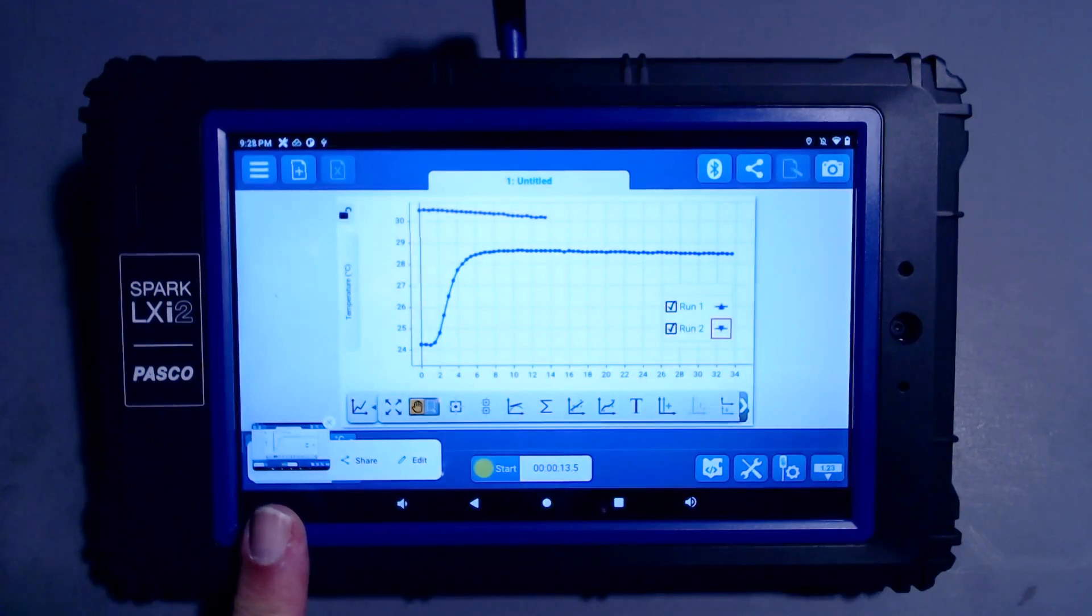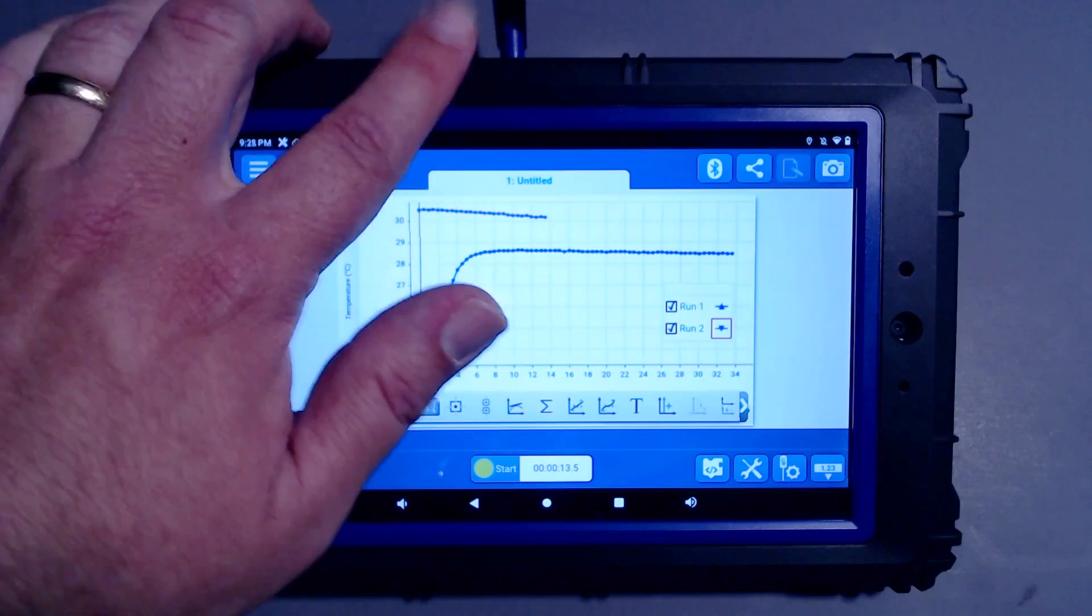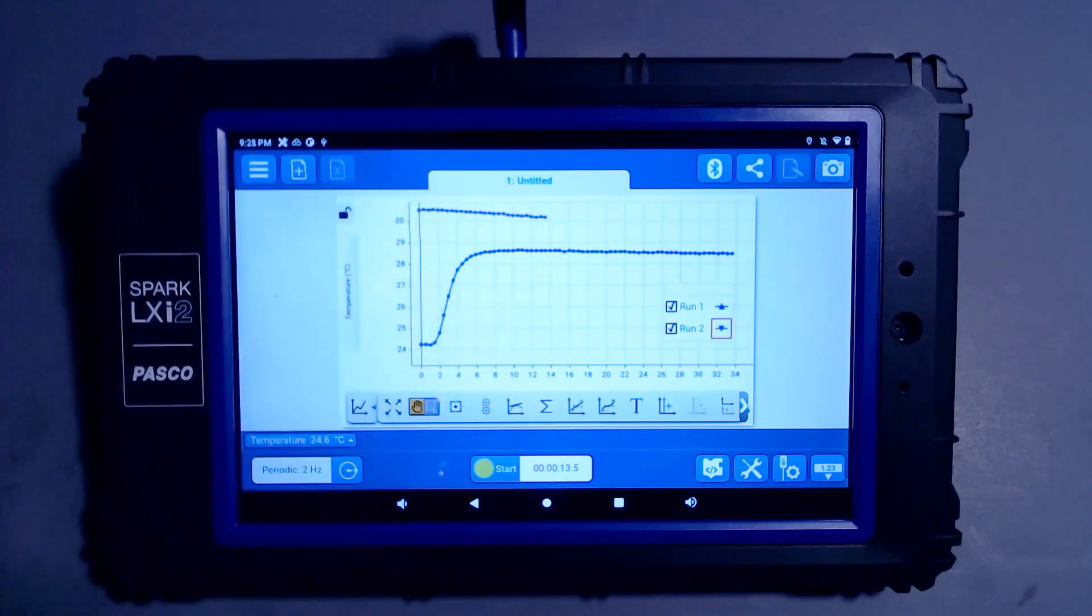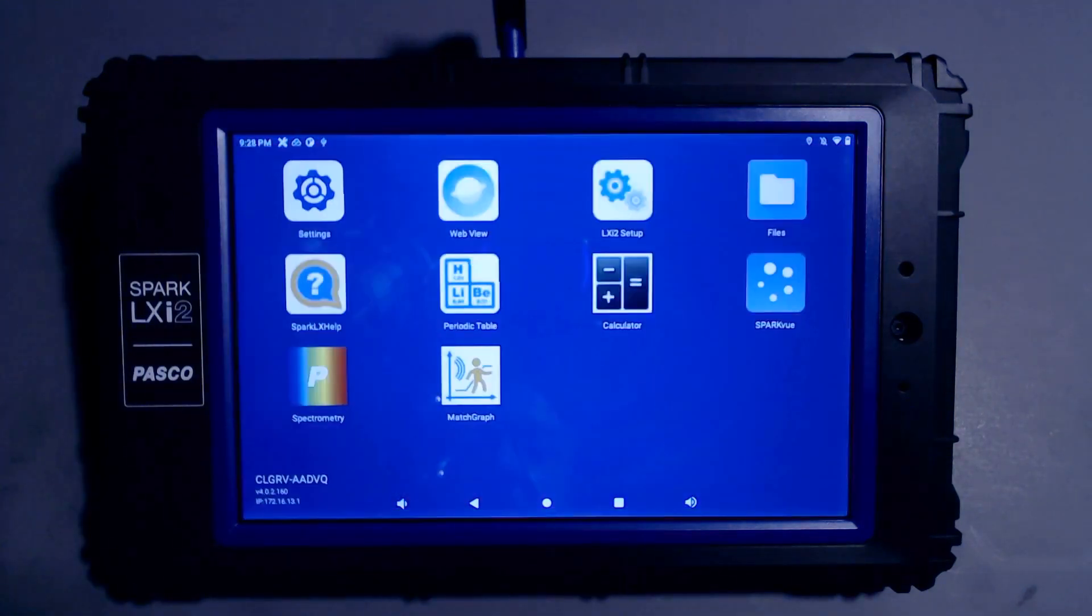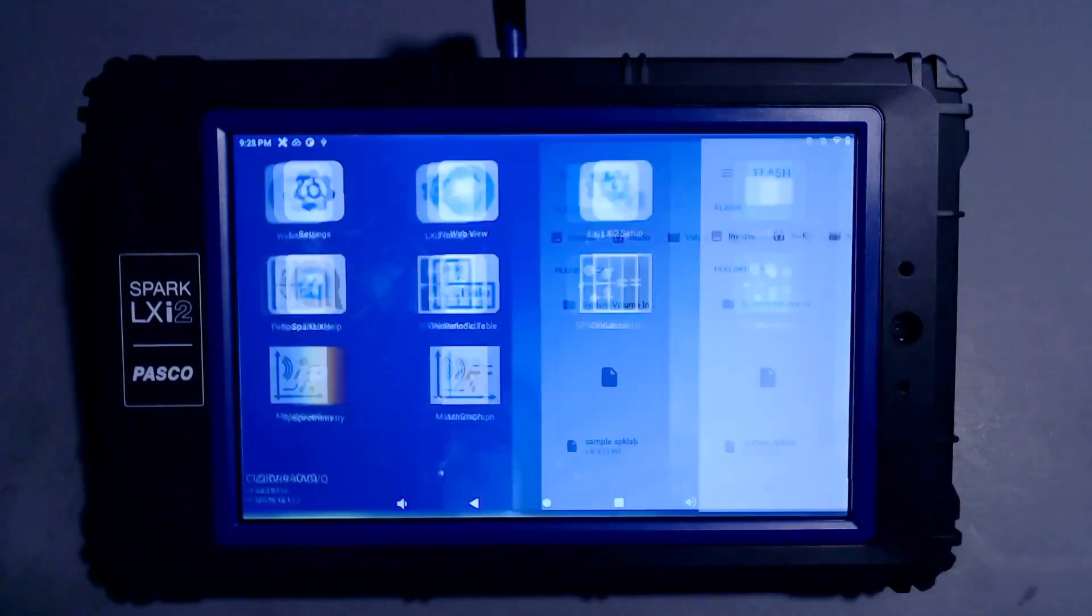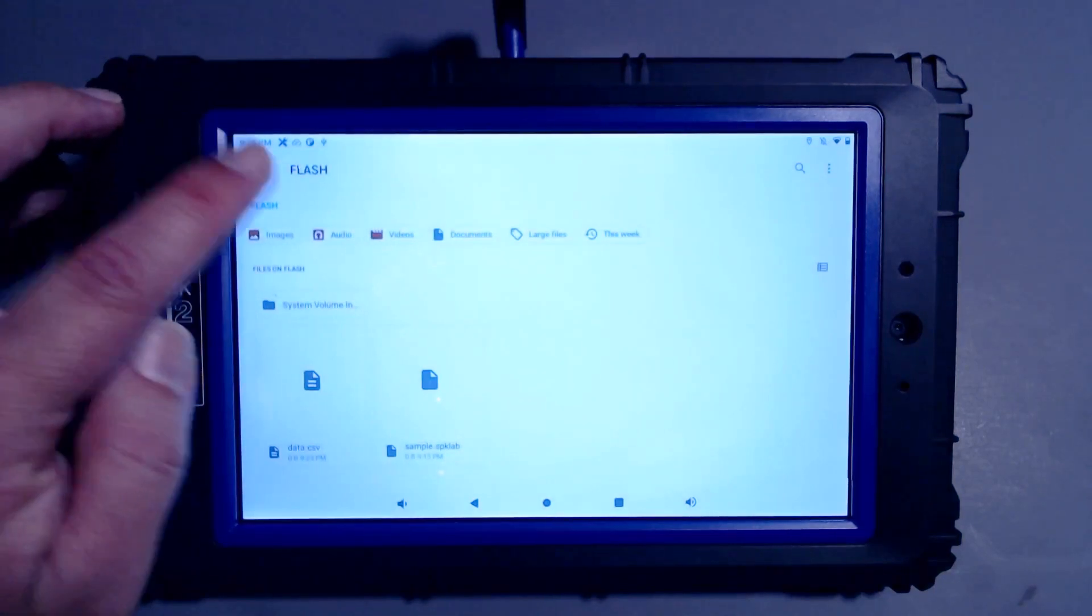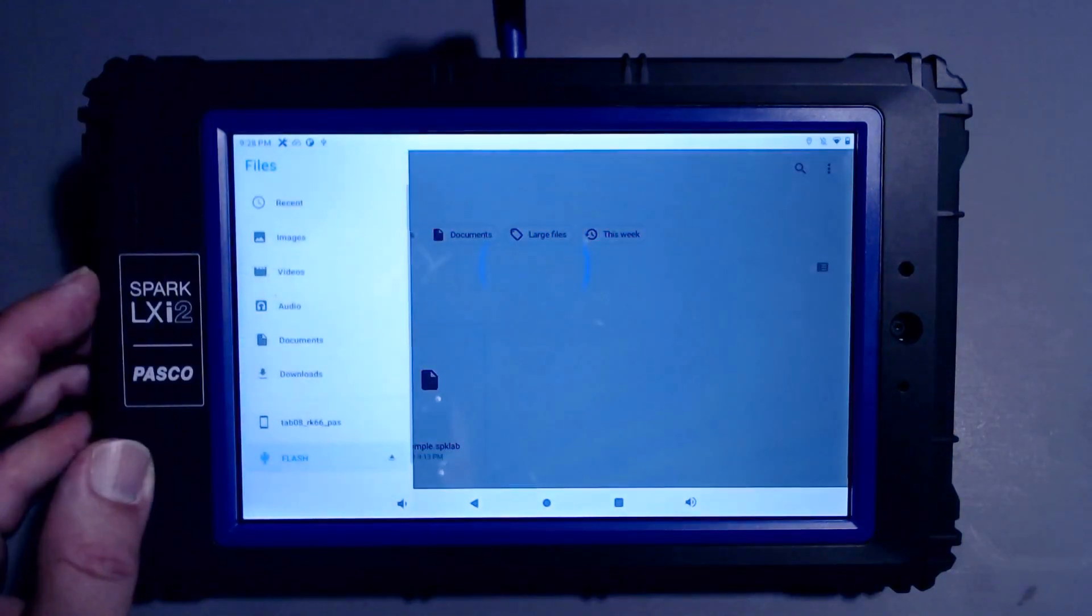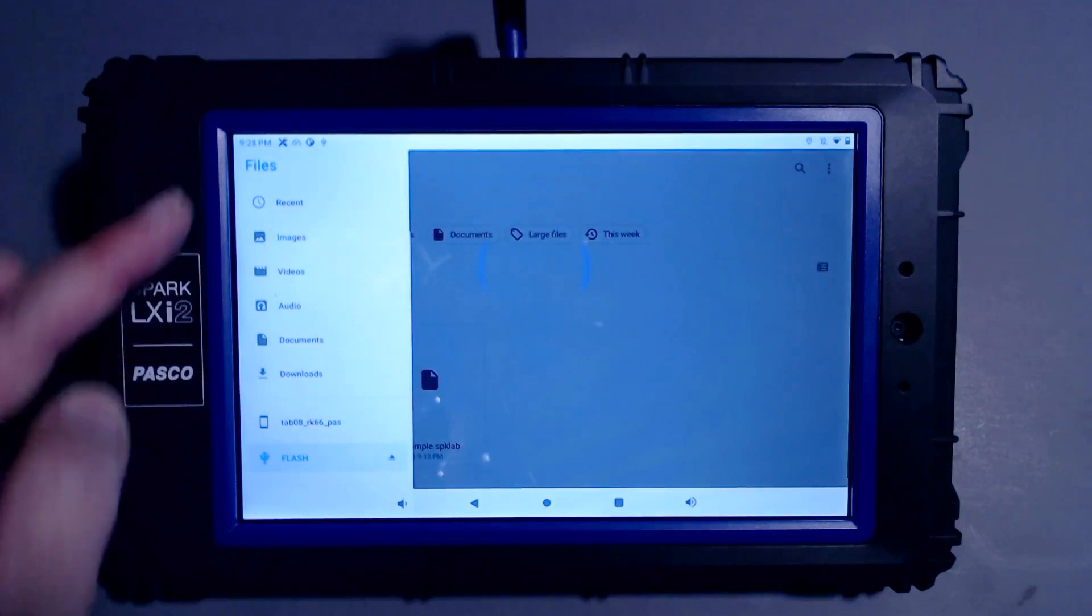Now I need to figure out where this screenshot is on the operating system so that I can transfer it to my USB flash drive. For that, I'll go to the home screen and choose the Files app, and I'll navigate to look at the files on my device.